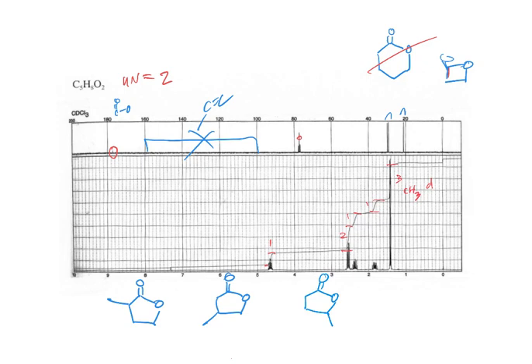Right. So if we take the protons next to the oxygen, where are they going to be? They're gonna be between 4 and 5. Yeah. And how many are there? There's only one. So what does that tell us? That the methyl has to be this one, right? Because there's only one proton there. So this one is going to be here. And of course this methyl group is here.